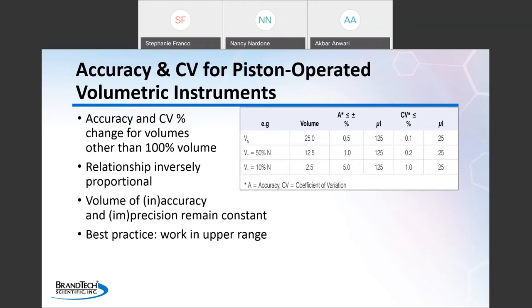So obviously, whoever performs the calibration for your liquid handling instruments is an individual decision. There are several factors that are going to go into the decision on who does your calibrations, including convenience, available resources, cost, and documentation requirements for your lab. Part of the decision process should include an understanding of the standards that relate to calibration of your liquid handling instruments.